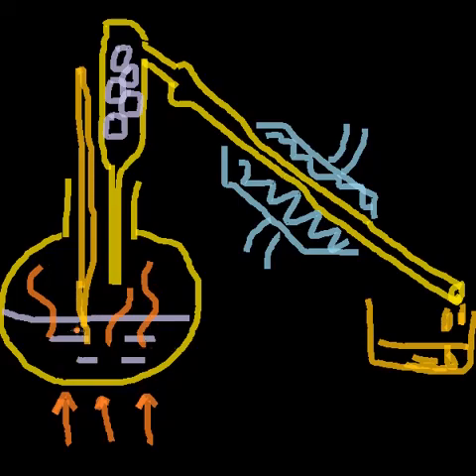And since the difference of temperature is very small, that is less than 25 Kelvin, we need to condense this very fast. And hence when these vapors pass through this fractionating column, these glass beads or glass balls provide greater surface for condensation, and hence the condensation process starts from this place itself.